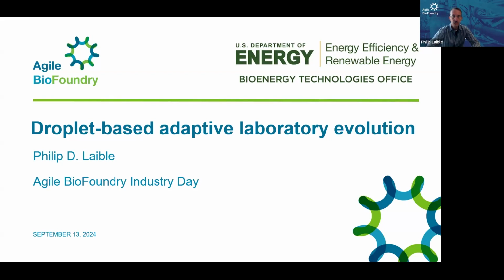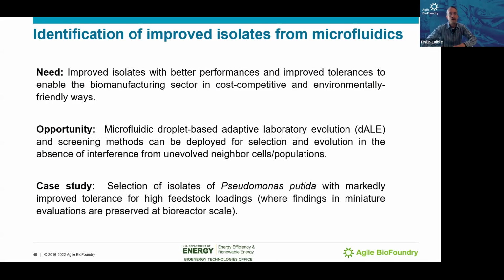I'm representing a team here at Argonne National Laboratory that is working on miniaturizing adaptive laboratory evolution approaches. Next slide, please. In order to uncover improved isolates or engineer improved isolates with better performance, and, as Charles mentioned, improved tolerances for various things, and we'll talk more about that in a little bit, we're going to need new approaches. And this is an approach that we've developed at Argonne National Laboratory based upon microfluidics.